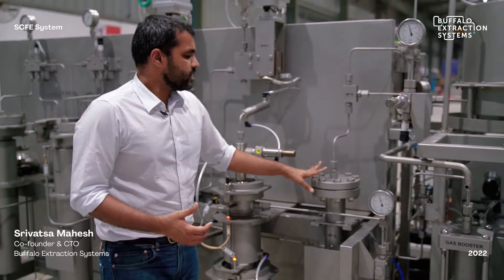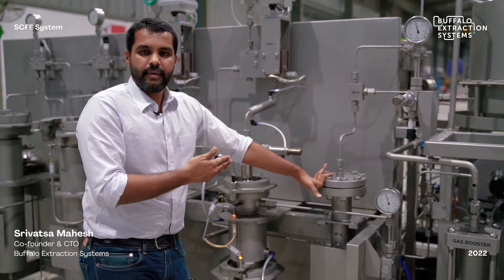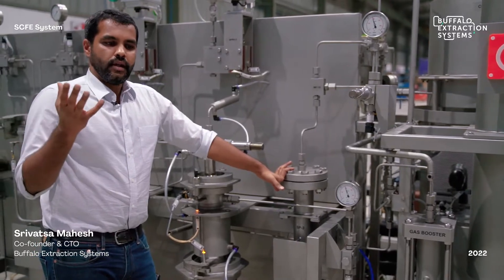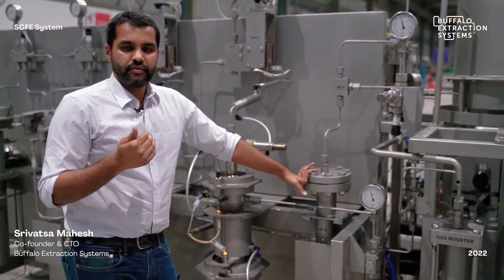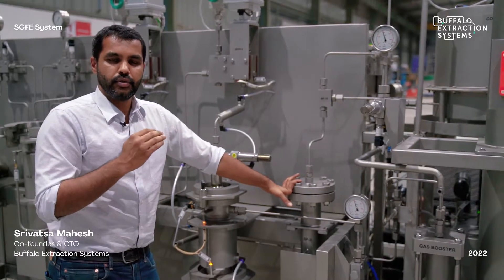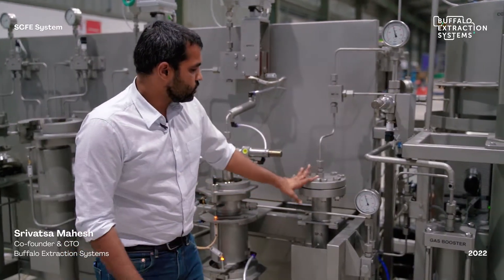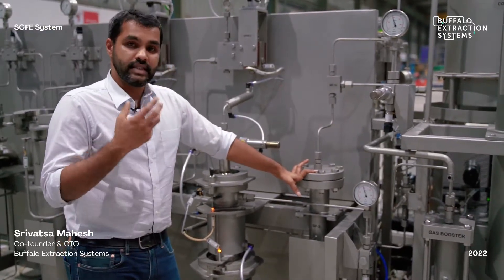The third separator also prevents water extracted from the biomass from going back into the recirculation line. This is important because when pressurizing CO2 up to 350 bar, the input CO2 temperature is between 2 to 4 degrees Celsius, and any variability could cause freezing of the water. So it is essential to have this third separator to remove all water from the CO2.